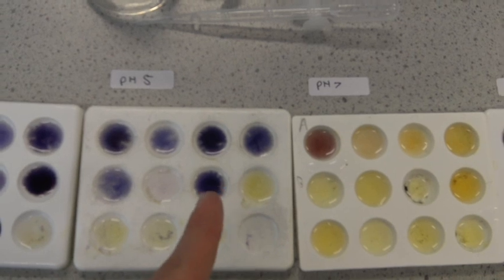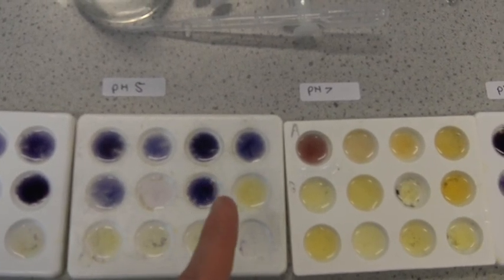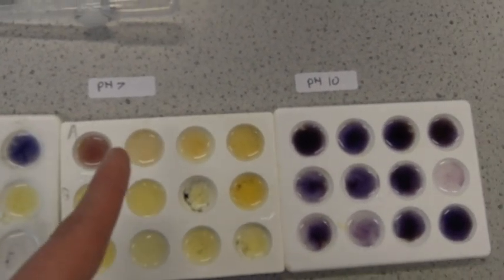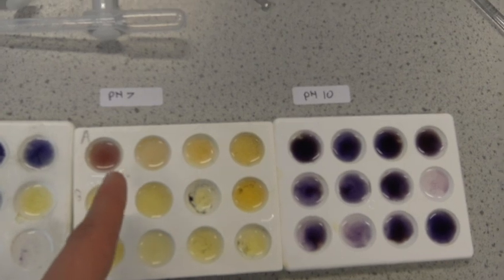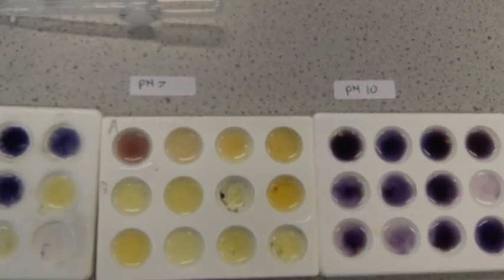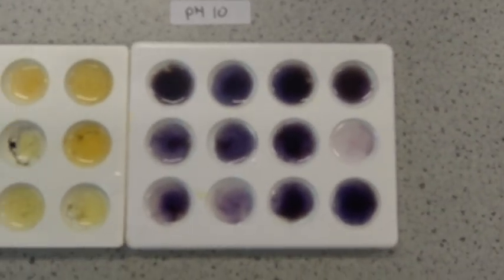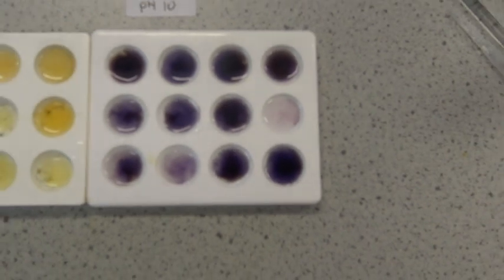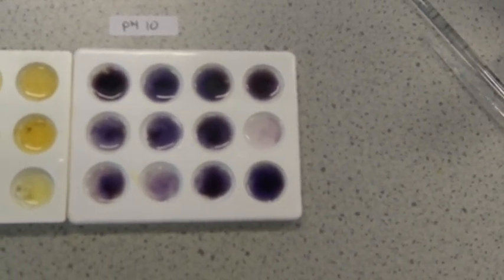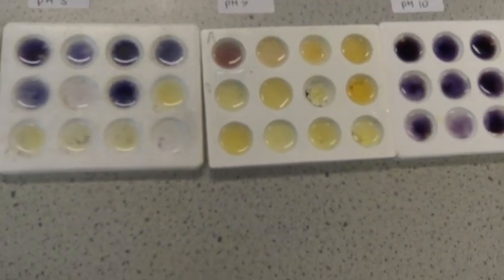At pH 7, wow, that happened really quickly — after just 10 seconds, all of the others are showing no starch present. And at pH 10, starch is present in every single one of them, which means the enzyme isn't working very well at pH 10.